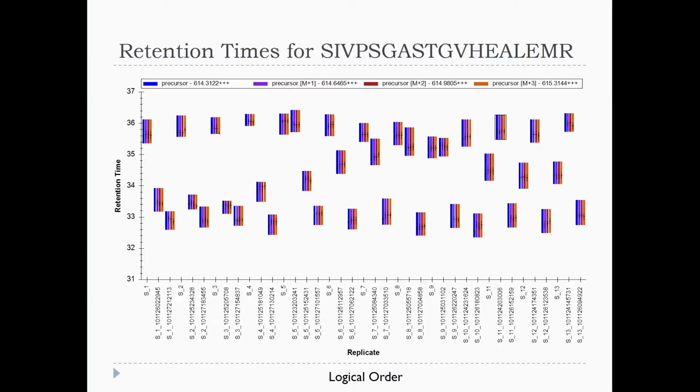So now's the participatory part. I'm going to show you graphs, and we're going to look at the graphs and try to understand them together, and then volunteer early, because if people don't volunteer, I'll start calling on people. So as soon as you think you have some explanation for this graph, go ahead and let me know.